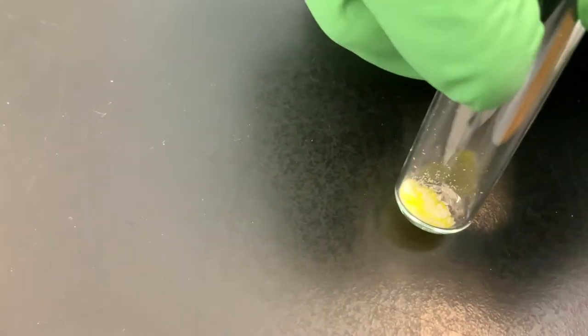And so ultimately now, we started out with them isolated, but the whole point of the experiment is to put them together and then see how we can isolate them back and determine how good we were in terms of separation, right? So for example, we started with 51 milligrams of benzoic acid. If we end up collecting 51 milligrams back, that means we did a 100% good job. But of course, we're not gonna see that, but hopefully we get somewhere close in the 90s.